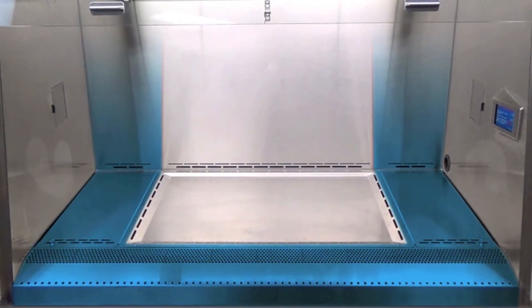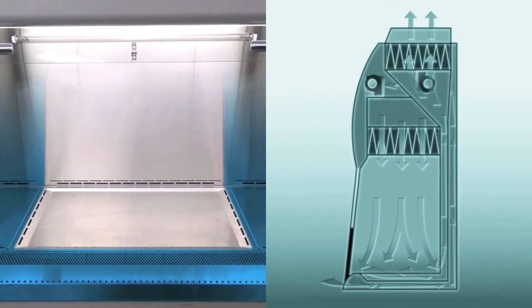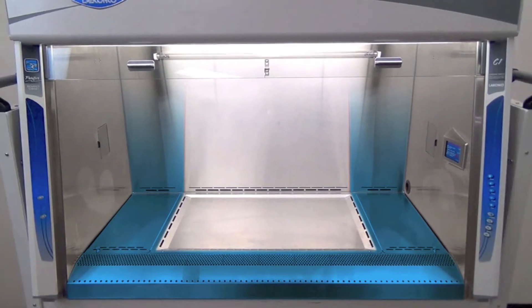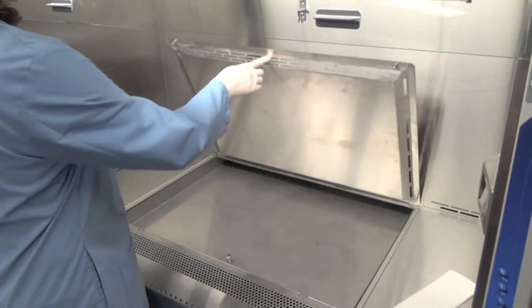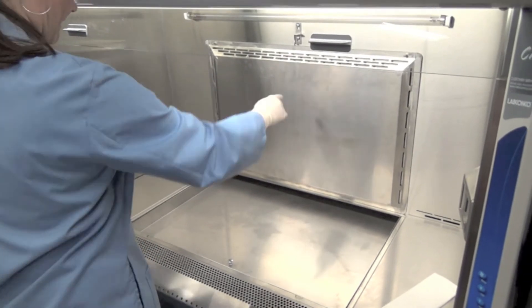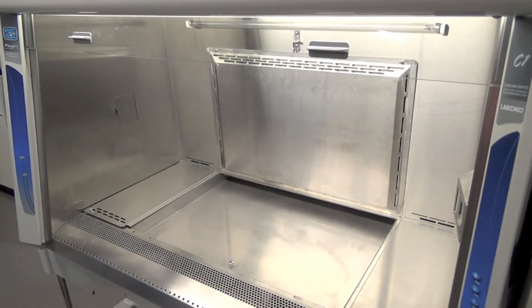Downflow air and air taken in at the grill remains outside of the ChemZone and is recirculated to save energy in ducted applications. The ChemZone work surface and interior can be broken down for easy decontamination, and the ChemZone latch allows for hands-free spill cleanup.